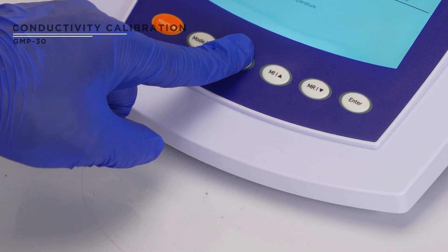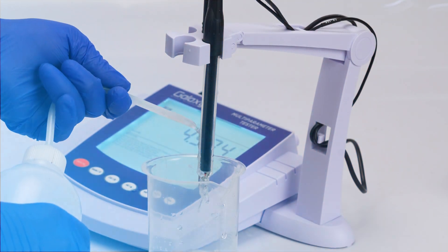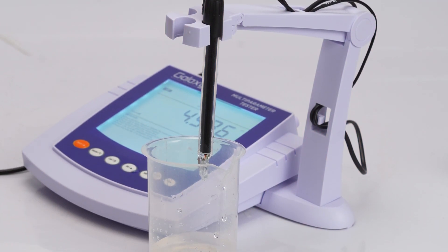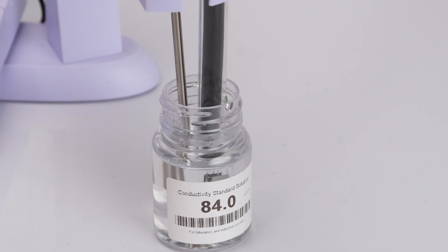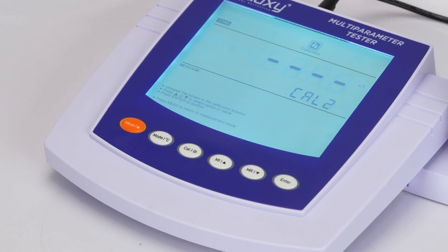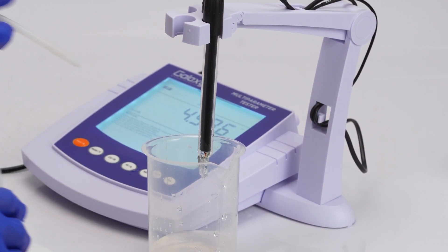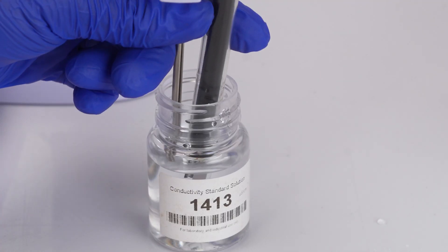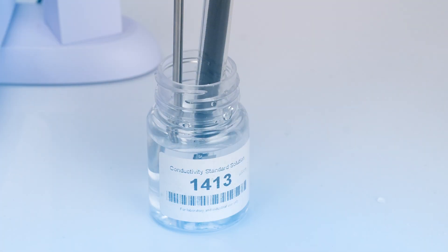Rinse the electrode and immerse it in the first buffer at 84 microsiemens per centimeter, then press enter. When cal two displays, rinse the electrode and immerse it in the second buffer at 1413 microsiemens per centimeter, then press enter.